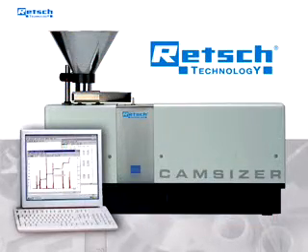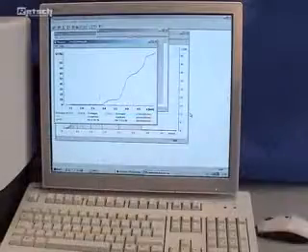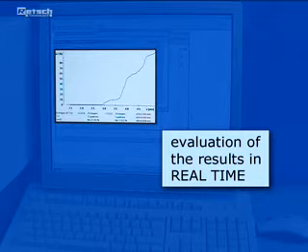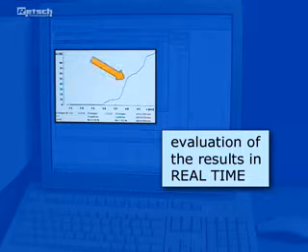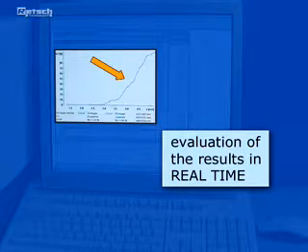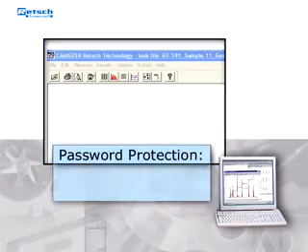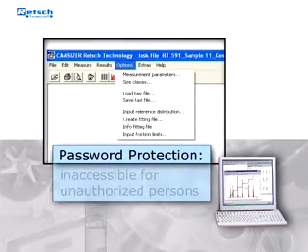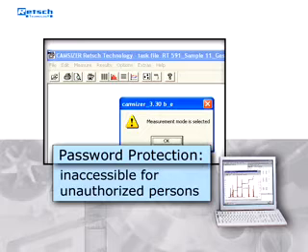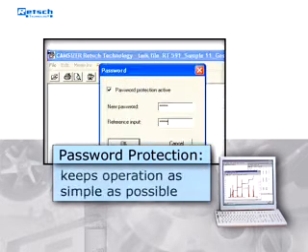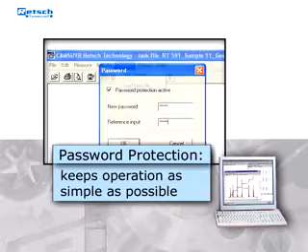An essential advantage in the practical application of the Camsizer is the evaluation of the results in real time. Graphical representations of the results are even available during measurement. Furthermore, a password protection makes the chosen and stored parameters inaccessible for unauthorized persons, avoiding abuse of the system and keeping its operation as simple as possible.